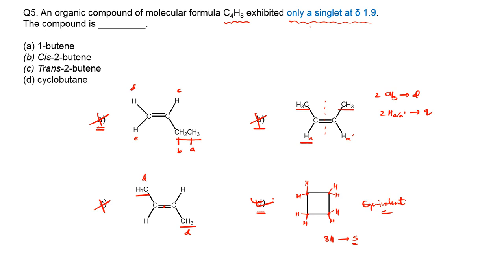Dear students, I hope this material will help guide you in understanding the basic NMR problems. In the continuation of this discussion, we'll take a few more examples that will guide us in understanding how to relate chemical shift, coupling constant, and other complexities of the 1H NMR spectrum in detail.